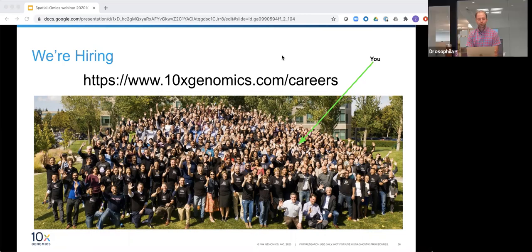That's a great question. We're still a ways off from understanding what our in situ project will look like. Hopefully it'll be pretty sensitive. The goal of in situ is really that single molecule resolution. In terms of the difference between single cell 3' and our Visium platform, the Visium platform is a bit less sensitive than single cell.